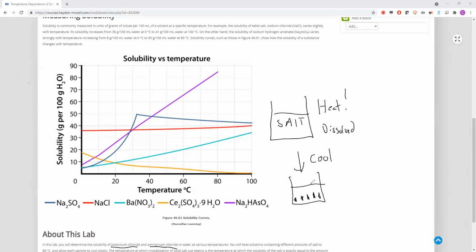So to be soluble is you don't see any solid. If you have more salt in your solution that's over your solubility limit, some of that salt will crash out, or come out of solution in the form of solids. I can show this on this purple chart just as another idea of why this would happen.